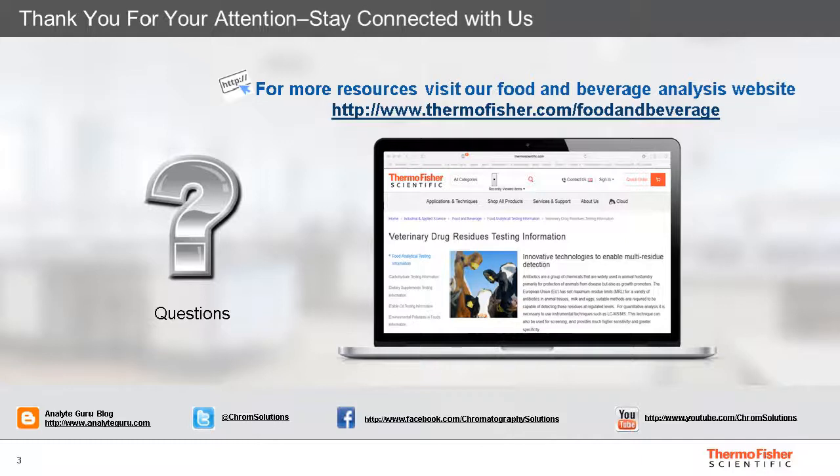Of course, we need to change the eluent cartridge. We need to change the column to a cationic exchanger and the suppressor. Of course, it is possible to use a single-channel system, but it will take something in the range of 1.5 to 2 hours to change and equilibrate the system. But there is also a two-channel system available. It's called Dionex ICS-6000. That can be set up with one channel for cations and the other for anions. So then the operator can switch from one to the other in minutes.